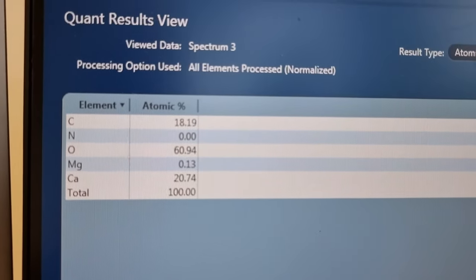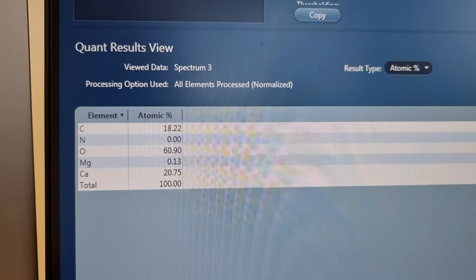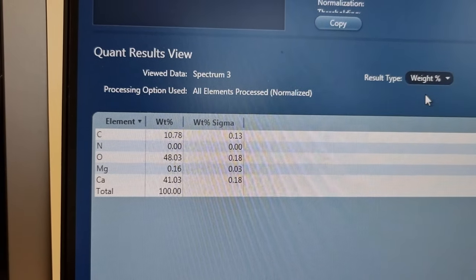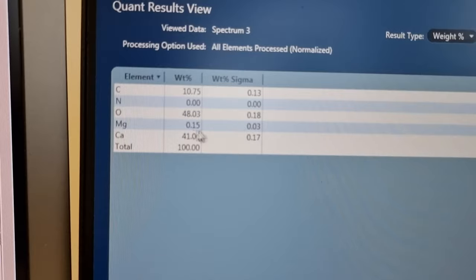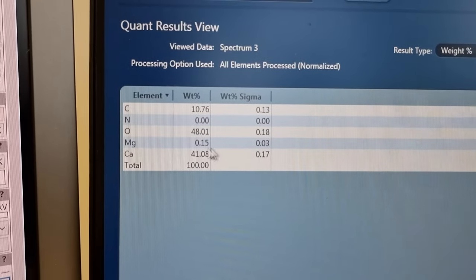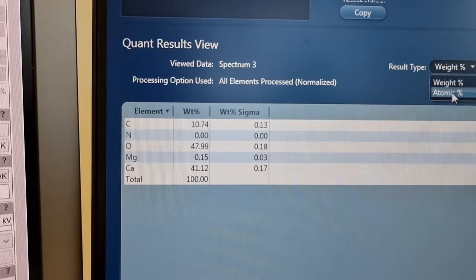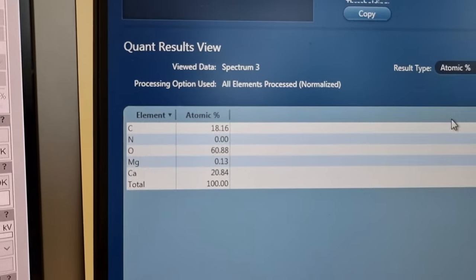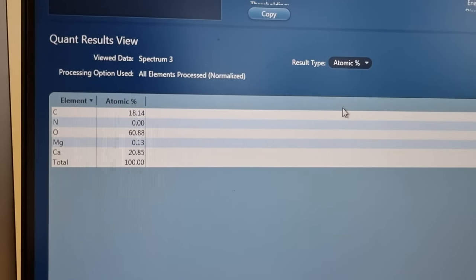But it's below the detection threshold, so actually if you go to weight percent you can see that it's just 0.15%. And so it's not a reliable measurement, but I do suspect it has some magnesium in there.